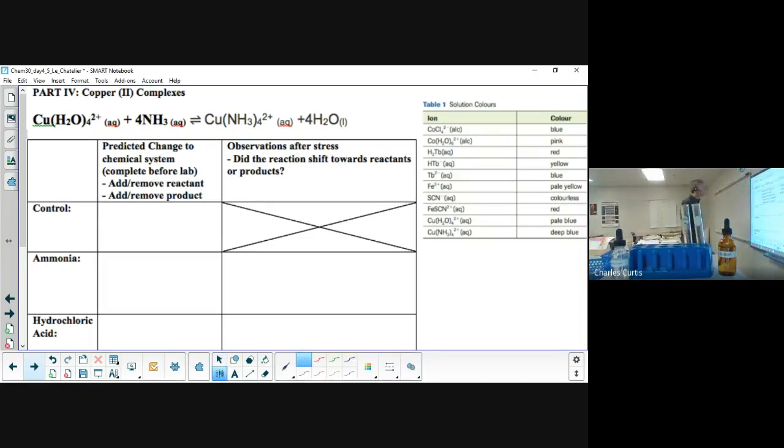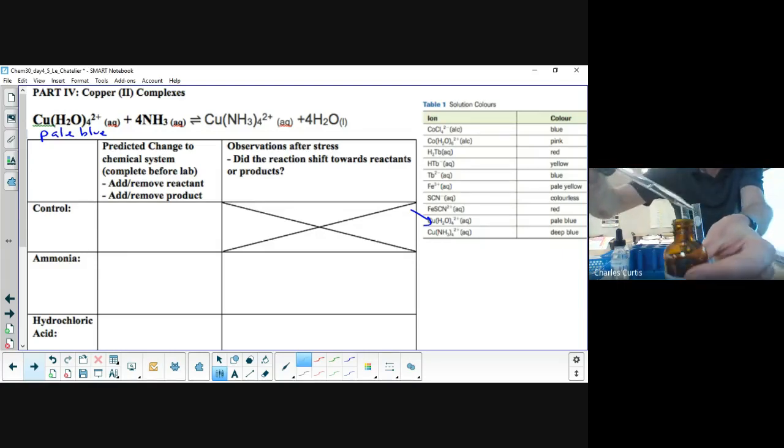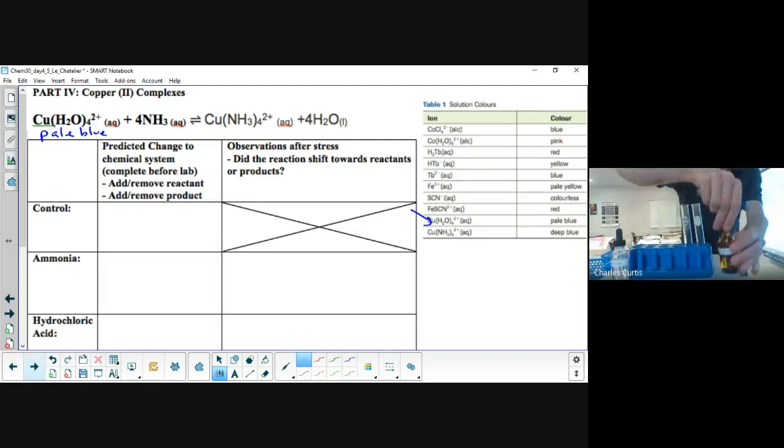First is to figure out what the colors mean. So copper complexed with water is down there. That's a pale blue. Okay. Ammonia, we don't have in a table, but we have some in a bottle. It's a brown bottle, but it is a clear solution. There is some in the eyedropper, and there is no color to it. So I'm not going to write anything clear on my board.